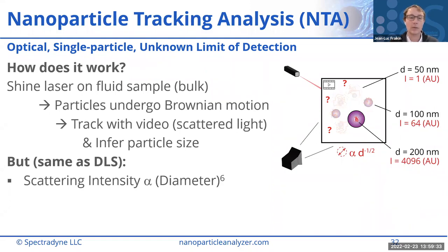Great question. So one of the details of our technology we didn't get into is that on every analysis cartridge, there's a built-in pre-filter that excludes particles that are larger than the nanoconstriction, right? So that prevents frequent blockages of the constriction and enables you to run very complex samples, including those that have bigger particles, much more easily.